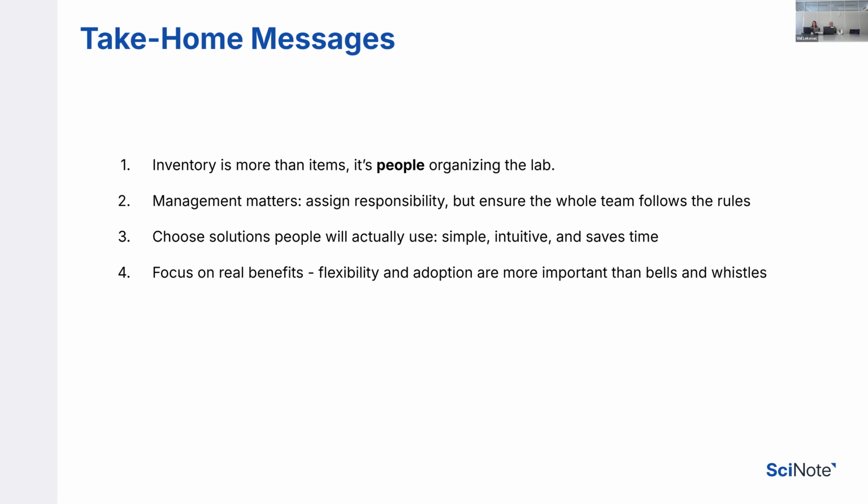As I already mentioned, the most effective teams are the teams with strong leadership. So making sure that responsibilities are assigned clearly and that everyone knows their role. But even more important is that there are protocols that are clear, straightforward, and that everyone is following the same standardized processes. Then, choose a solution people will actually use: simple, intuitive, and that saves time.